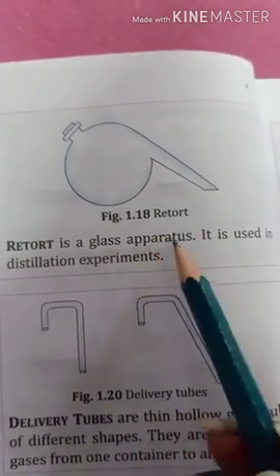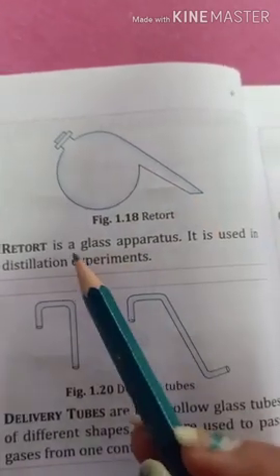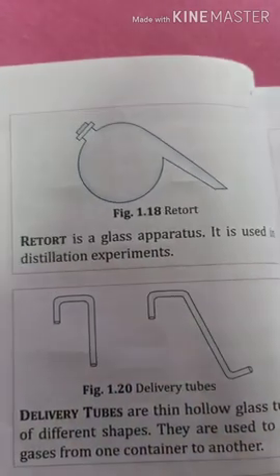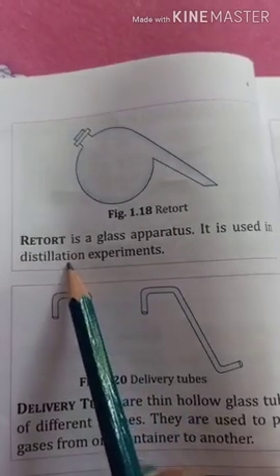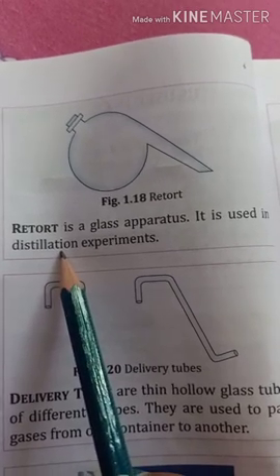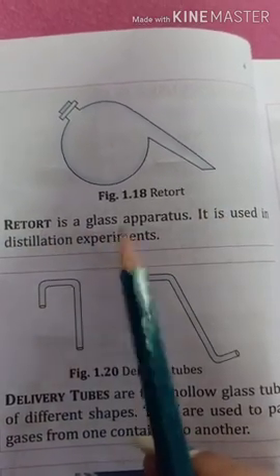Next apparatus is retort. Retort is a glass apparatus. This is retort, and this retort is also made up of glass. The main use of retort is in distillation processes. So what are distillation processes? Distillation processes are the processes of purification of liquid by heating as well as by cooling. So this retort is used in distillation experiments.